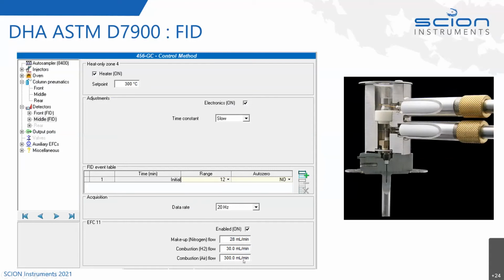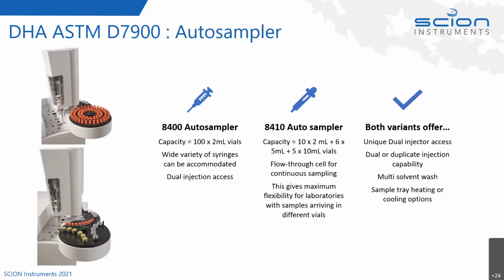And just like the simdist GC, we've got the same choice of autosamplers that can be used. I'll just skip over that. We've talked about that earlier.